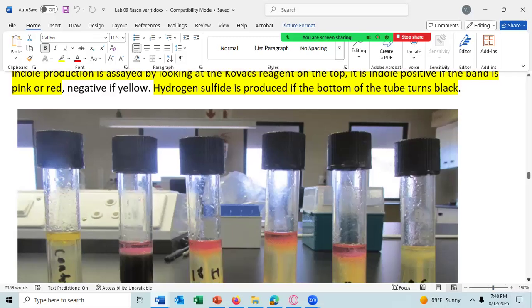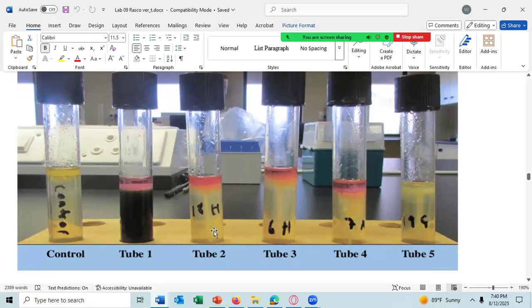On tube 3, we can clearly see the stab mark. On tube 4, we can see it, but it's not as clear as tube 2. And then tube 4, we have bubbling. The bacteria have not gone everywhere, but it has gone in this region here, especially the right side, and that's much greater than there or here. And so we can say that the bacteria on tube 4 is motile.